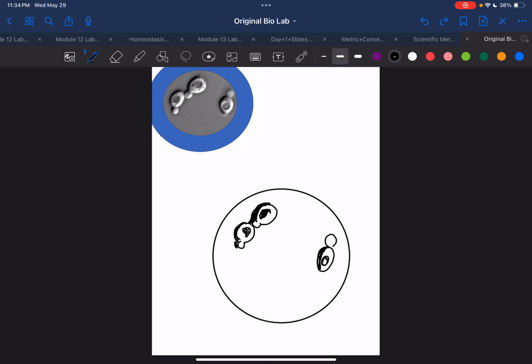So that's really what you're practicing. You're practicing drawing it so that it's as accurate as you see it on the microscope, right? That is the main idea. So again, I would probably draw this bigger. If I was measuring, this is just pretend, right? If this was an image, it's not on here, but the slide I got this from, the scale bar was 15 micrometers, right? So this is just me pretending. Don't copy mine because I don't have an actual ruler next to me.